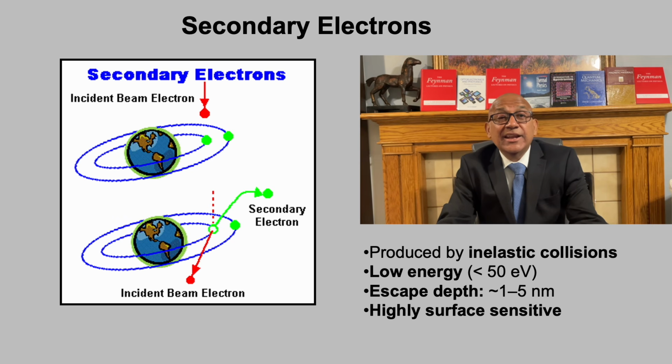Understanding the origin and energy of secondary electrons is essential because it explains both their strengths, high surface sensitivity, and their limitations, which we will contrast next with other SEM signals.